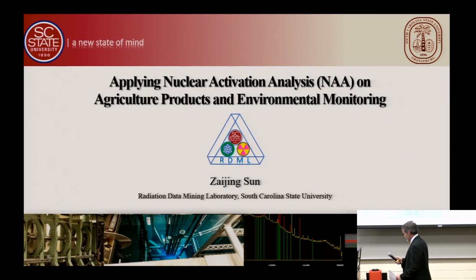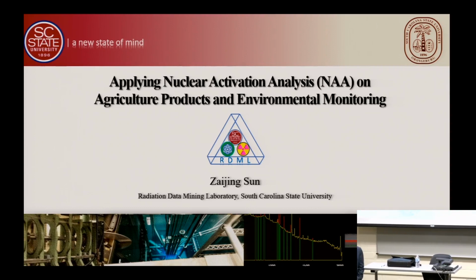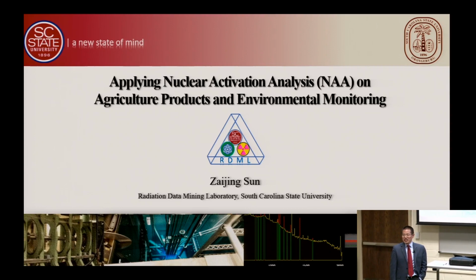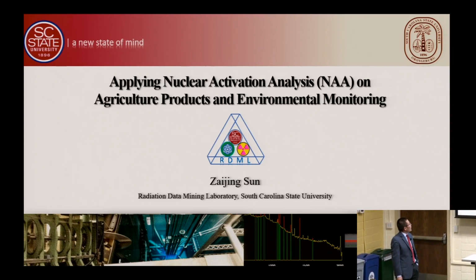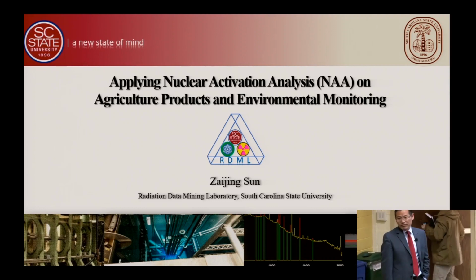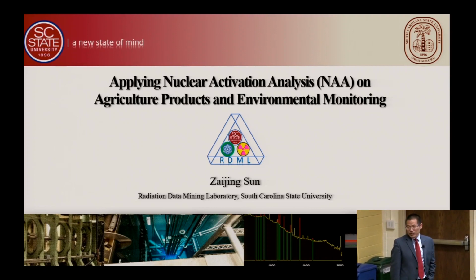Thank you. It's my honor to go to Knoxville and give a seminar at one of the oldest nuclear engineering programs in the United States. I'm going to talk about applying nuclear activation analysis, NAA, on agricultural products like coffee, cotton, and vegetables, and environmental monitoring. We try to figure out the legacy radioactive material contaminations in the air.